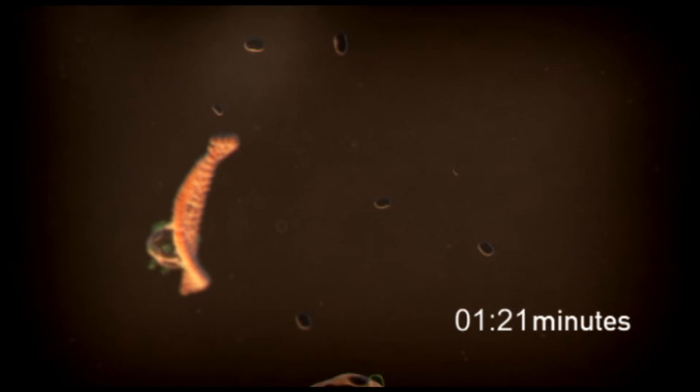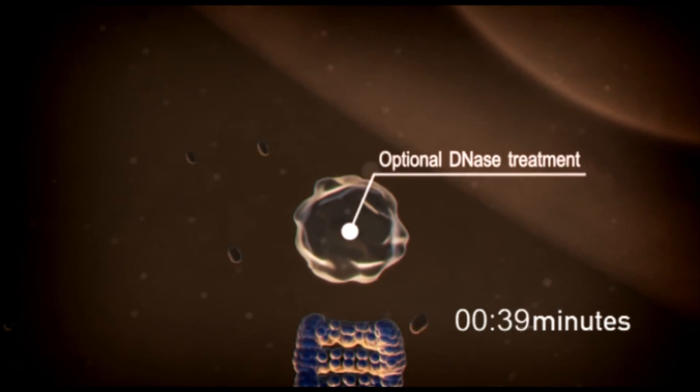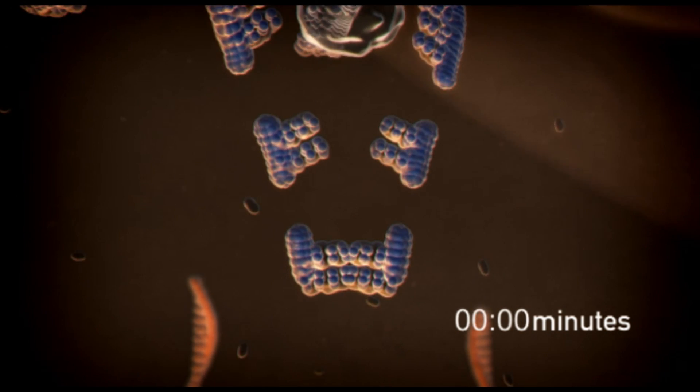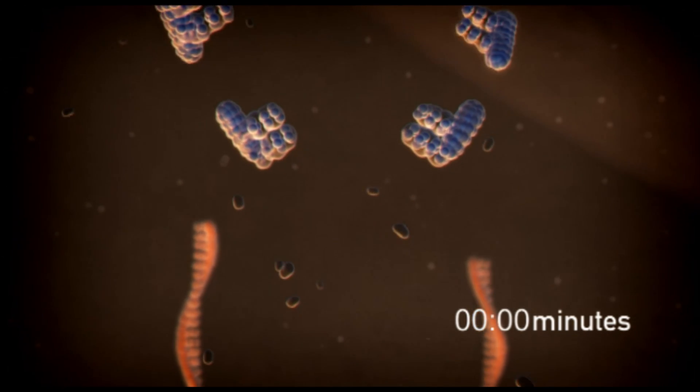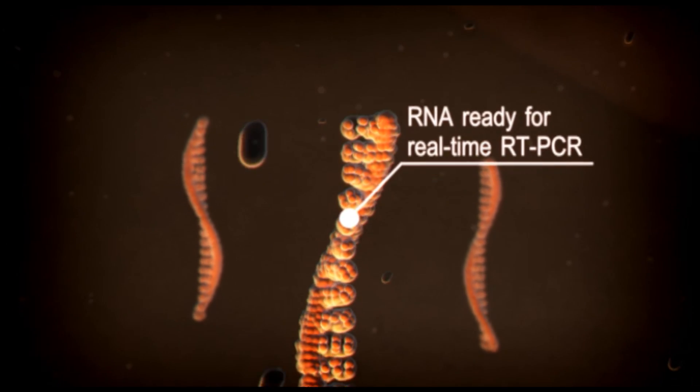If DNase is added to the lysis solution, genomic DNA is also degraded at this step. Five minutes later, a stop solution is mixed into the lysate to inactivate the lysis reagents, leaving you with a sample ready for real-time PCR.